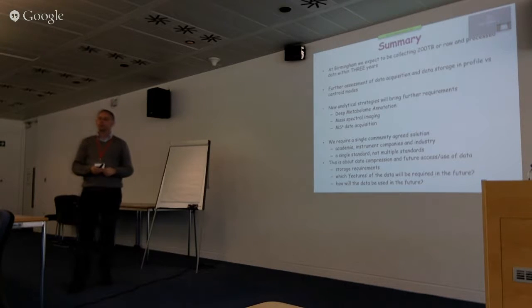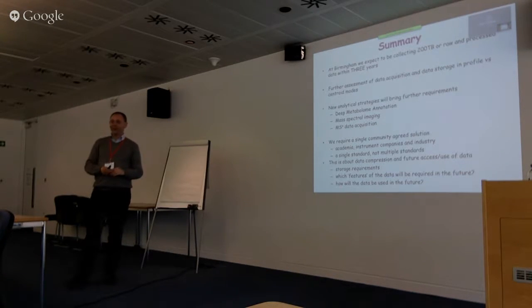But do things like throughput and speed and time to clean up and to fix things for the next run, do they change over time? No, you shouldn't see that unless there's a big problem with the instrument. Yeah. So I'm just trying to get a feel.